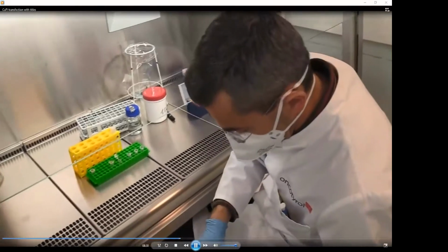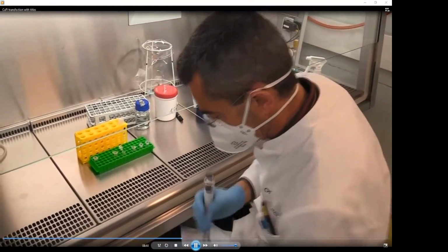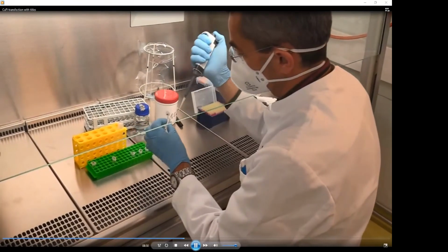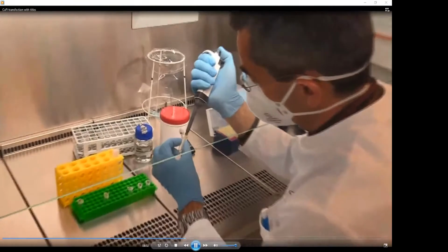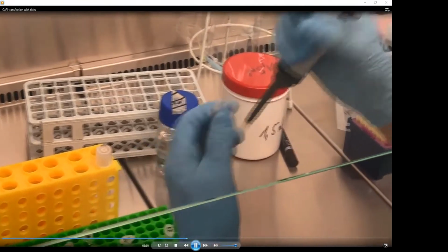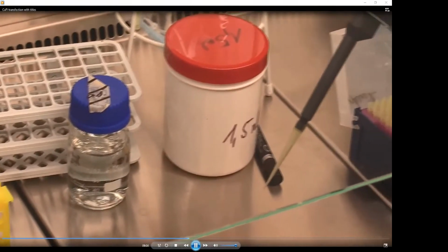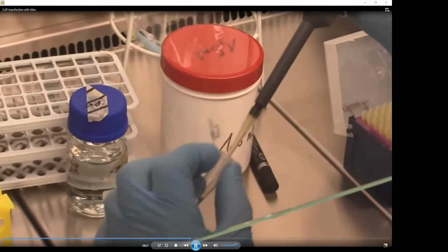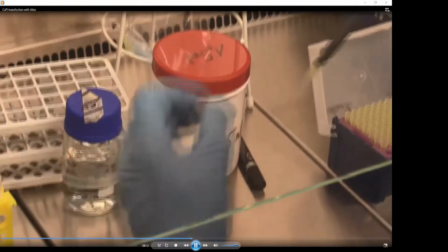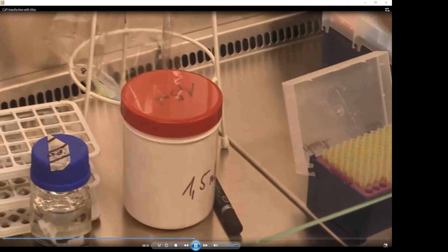Next part is the 140 microliters from this B, which we take out and use for the sample B2 and the second one for B3. So they contain already the reporter TOPflash. And in one case, we add this T7 DNA, and in the next one, we add beta-catenin. So this is from the master mix with our reporter DNA mixed with the reporter TOPflash. And the next one is the last sample, which will be once again the reporter, and we will co-transfect beta-catenin.